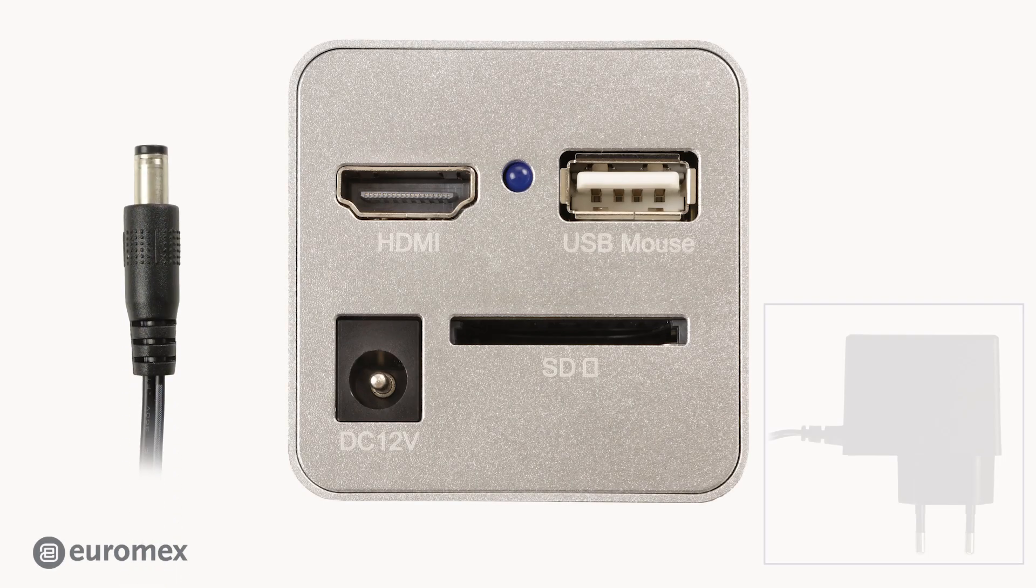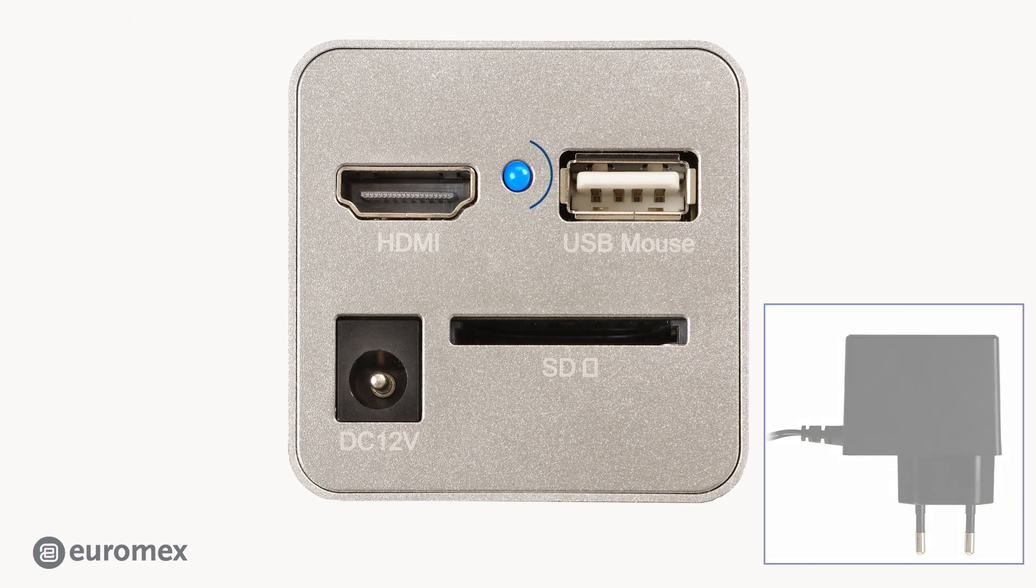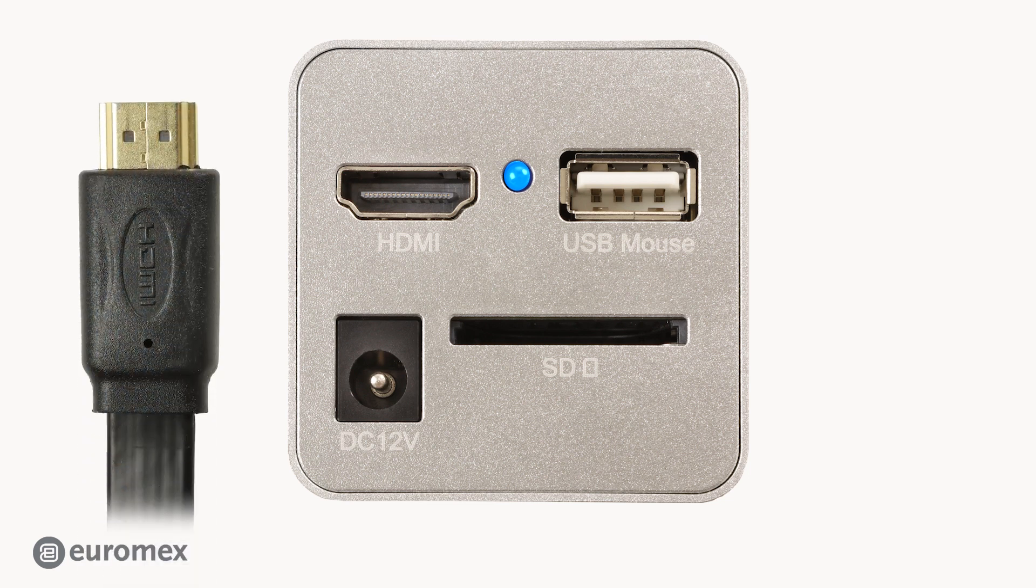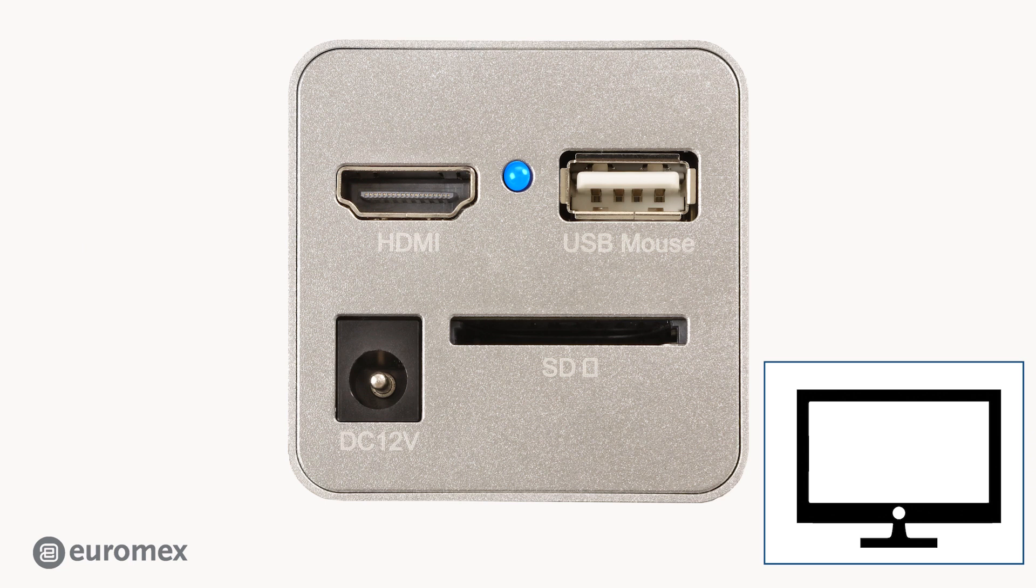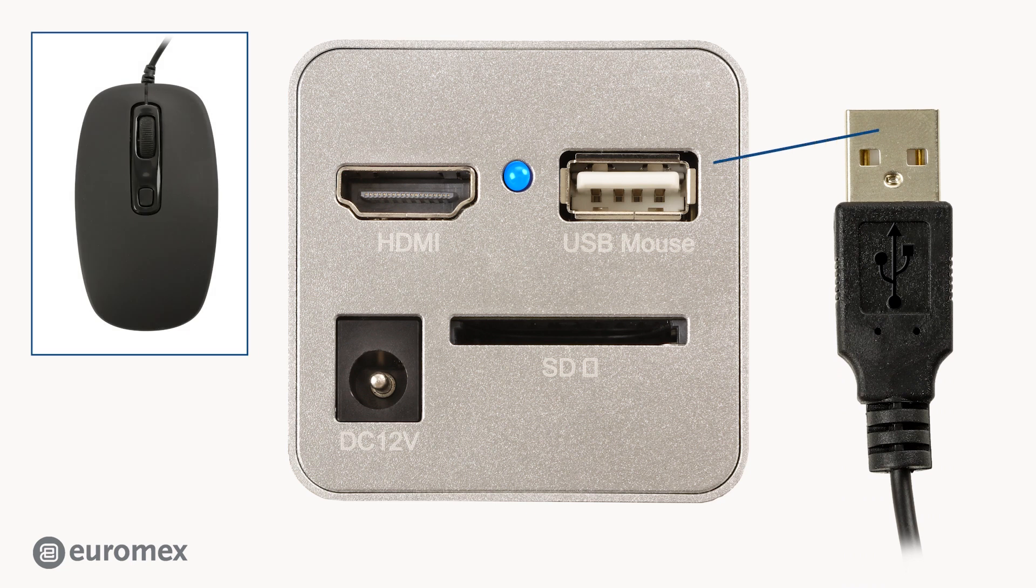Let's start with the power adapter. The LED flashes a couple of times until the camera is ready, then the LED stays on. Next, the HDMI cable is connected to the camera while the other side connects to a screen. The USB mouse is connected to the USB port.